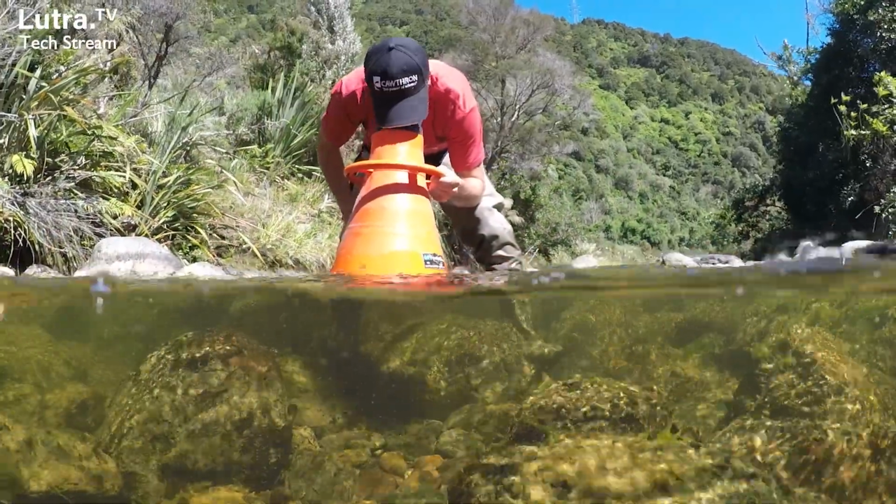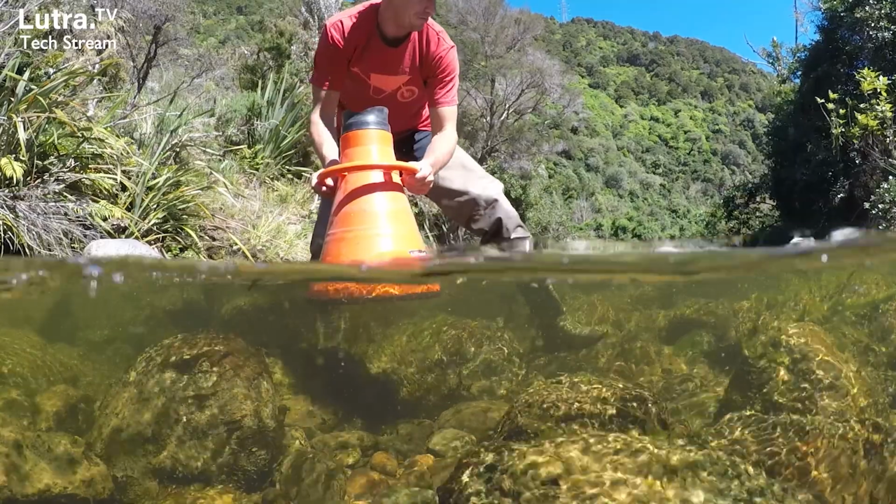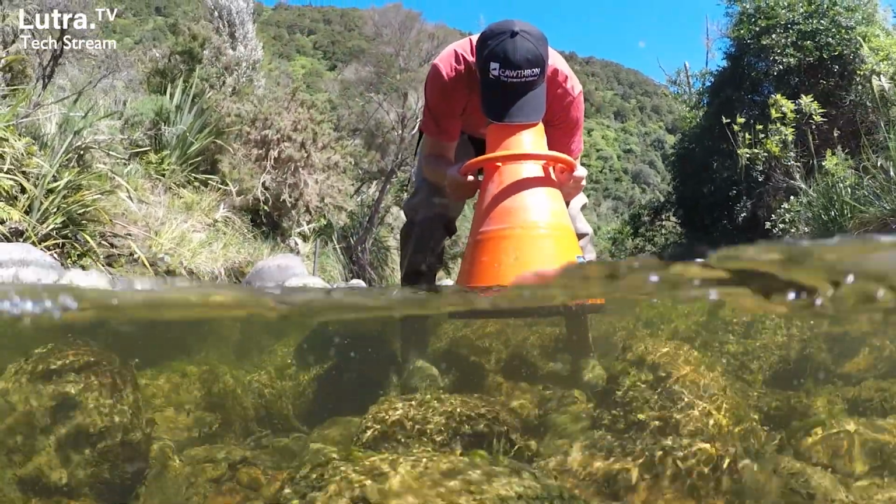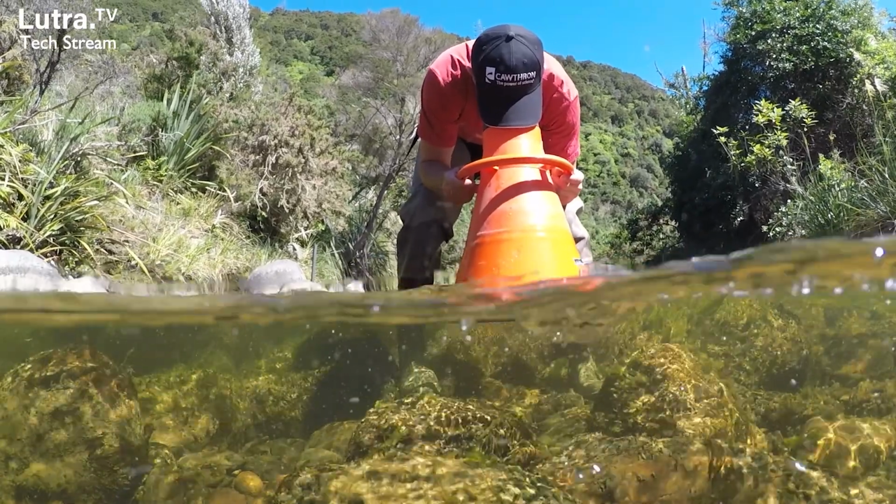Yeah, so I guess the first thing you are looking for is some discoloration in the water, maybe a little bit of a greeny tone, maybe something changing with your turbidity, or maybe you have a fluorescent probe. There are sensors now which detect the fluorescence from either chlorophyll or a compound produced specifically by cyanobacteria called phycocyanin. Okay. And you can detect quite low levels of those pigments in your water supply.